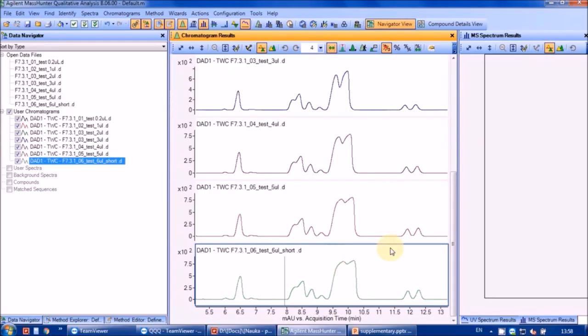In this case, we choose a compromise volume of 6 microliters, which corresponds to about 3 milligrams. So we will inject in overload mode, which is a common practice in preparative chromatography, especially in early stages. And with a total amount of 54 milligrams of sample, it will take us about 20 to 30 runs.